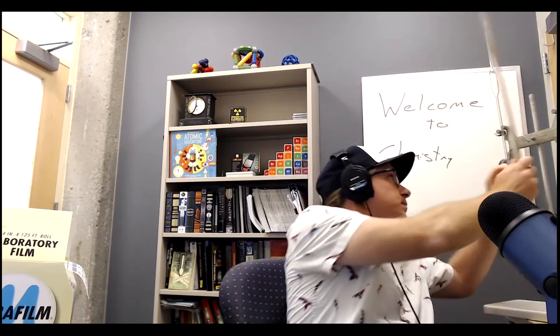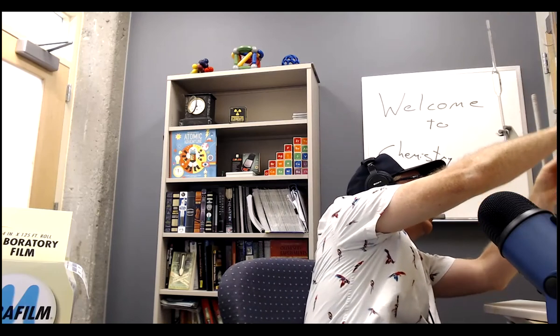For titrations, we know that before the equivalence point and after the equivalence point we're nowhere near the equivalence point, and we really only want that one. So you might just open it up to like 3 milliliters. I see that this pre-lab is getting a little bit long, but I'm going to try to give you one last tip on how to get good data, but not spend an hour on every single titration.